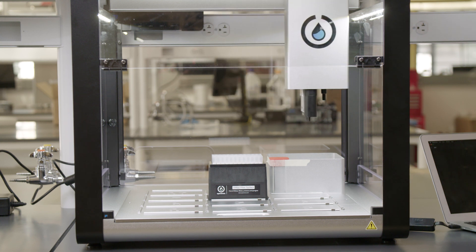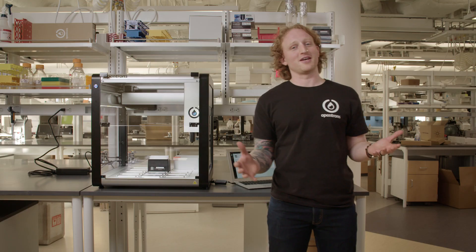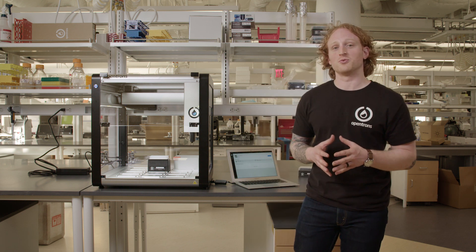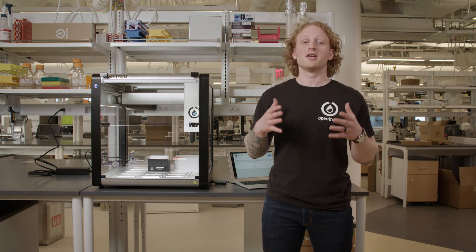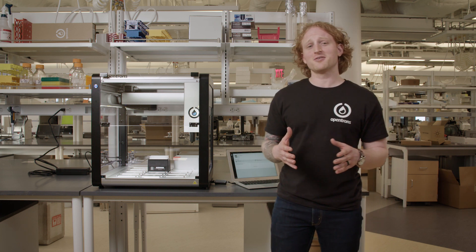The OT2 will home now. Tip length and pipette offset calibration are now complete. I am going to stop the video here before going on to running a protocol. Thanks for checking out the sixth video in our From Box to Protocol series. Now that I have calibrated the tip length and pipette offset, we are going to move on to actually running a protocol. Thanks for checking out the video and bye for now.